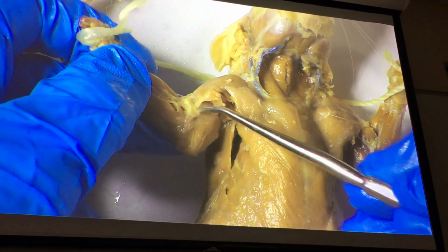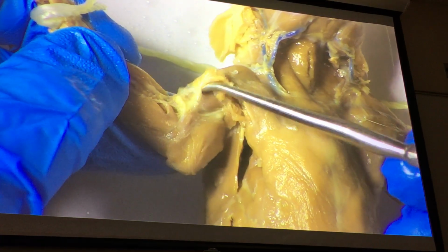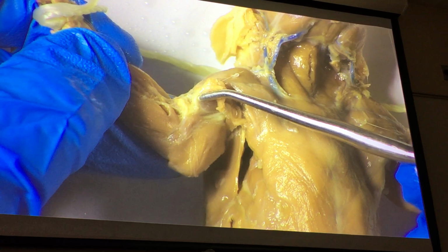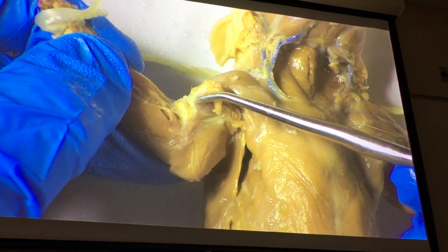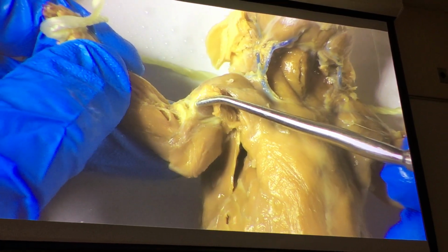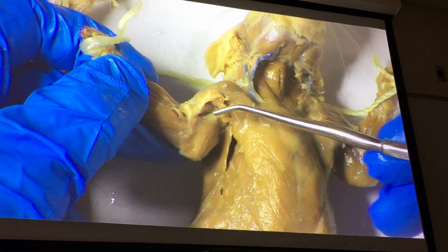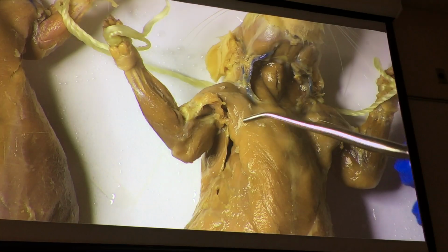That's the biceps femoris, right? Right there. That'll be on the other side. Brachialis is on the other side. Oh, did I say femoris? I'm sorry, yeah, biceps femoris. Biceps brachii. Thank you. Sorry about that. All right, so that's the ventral arm, chest.